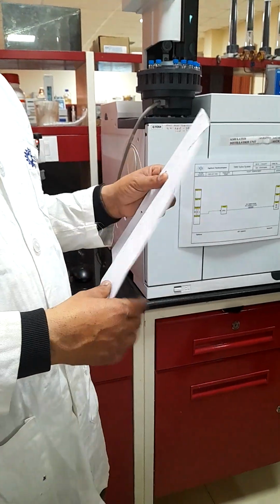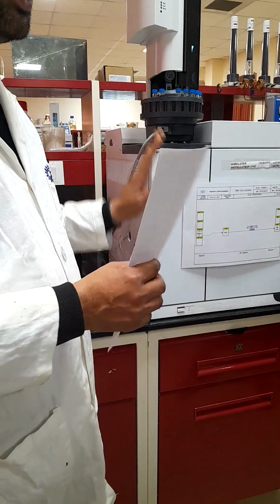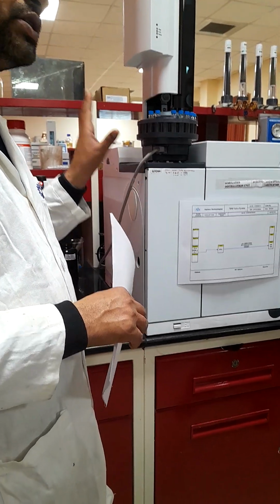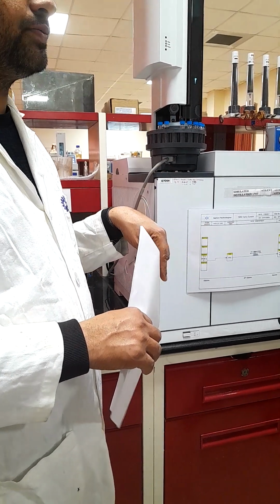So this is the way the GC SIMDIS, or simulation GC method, marks the IBP and FBP for simulated distillation applications, because here in this Advanced Crude Oil Research Center this GC is used for getting simulated distillation or distillation profile only, but this GC can have multiple applications.